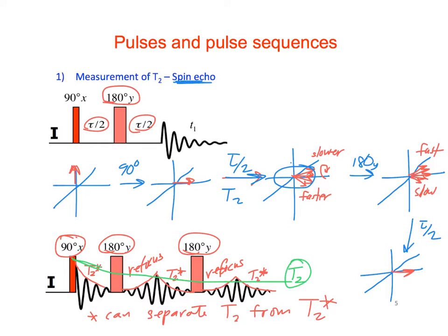All right, so that's kind of just a rough, dirty picture of at least what this spin echo experiment does. So into the 90, they start to lose phase, then they flip it this way, and then they refocus. And then they start to dephase again, and then another 180, and they refocus. They start to dephase, they just keep repeating that. But I'm not sure along the way here exactly when they stop acquisition and do a Fourier transform and look at the actual spectrum.